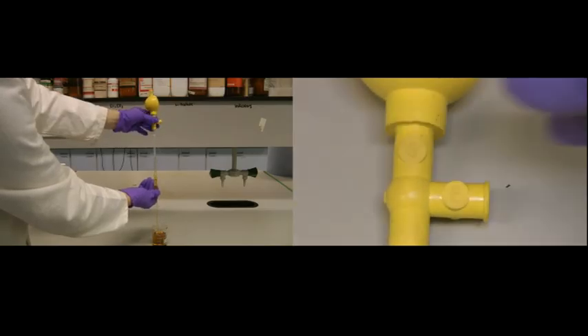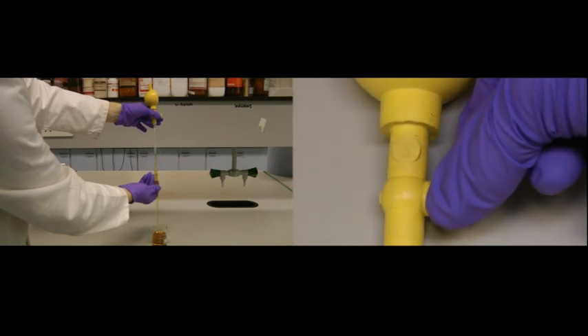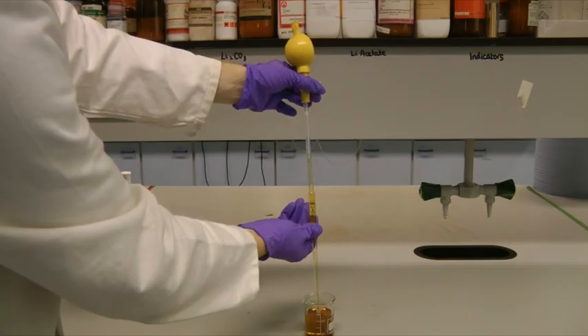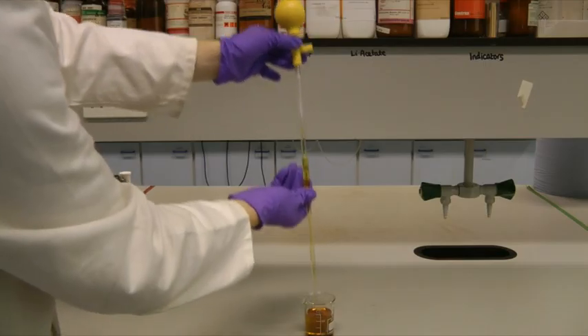You can release the liquid by pinching the valve at the side. Throughout, you need to be very careful not to overshoot the mark and ensure no liquid enters the bulb, as this can become contaminated or actually react with the inside of the bulb.